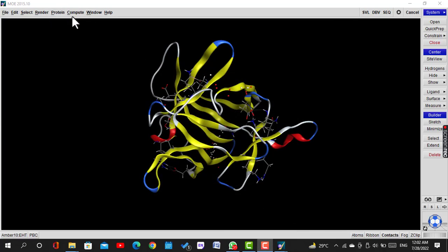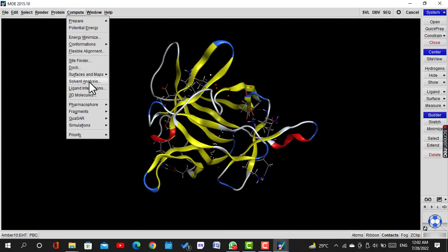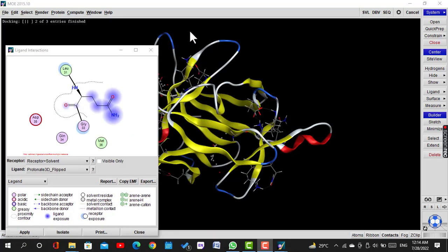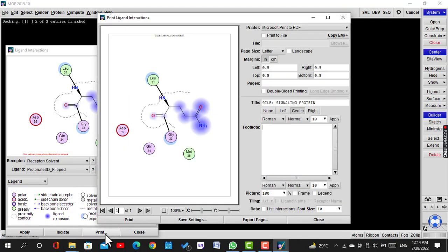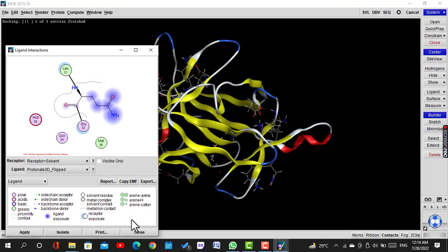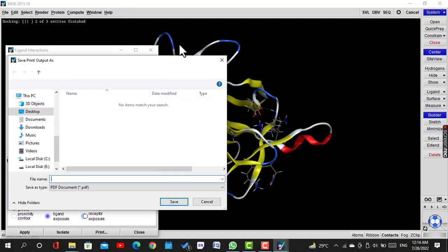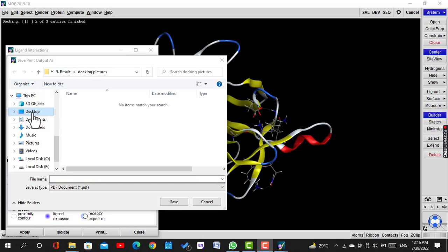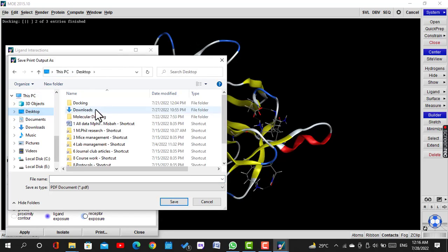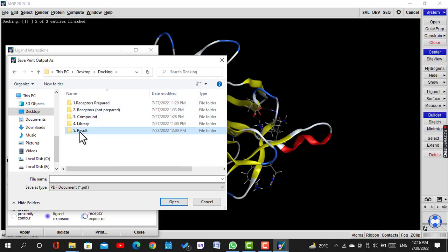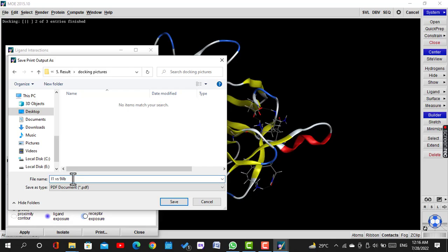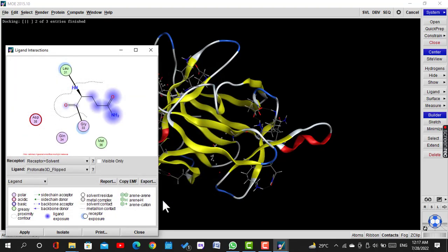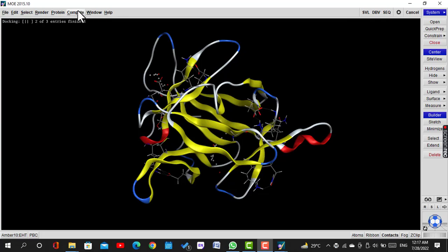Now click on Compute and then click on Ligand Interaction. We will copy the picture of ligand interaction by clicking on Print, and we save it in the docking folder, clicking on Results, and in docking pictures with the file name Library 1 versus 9ILB.